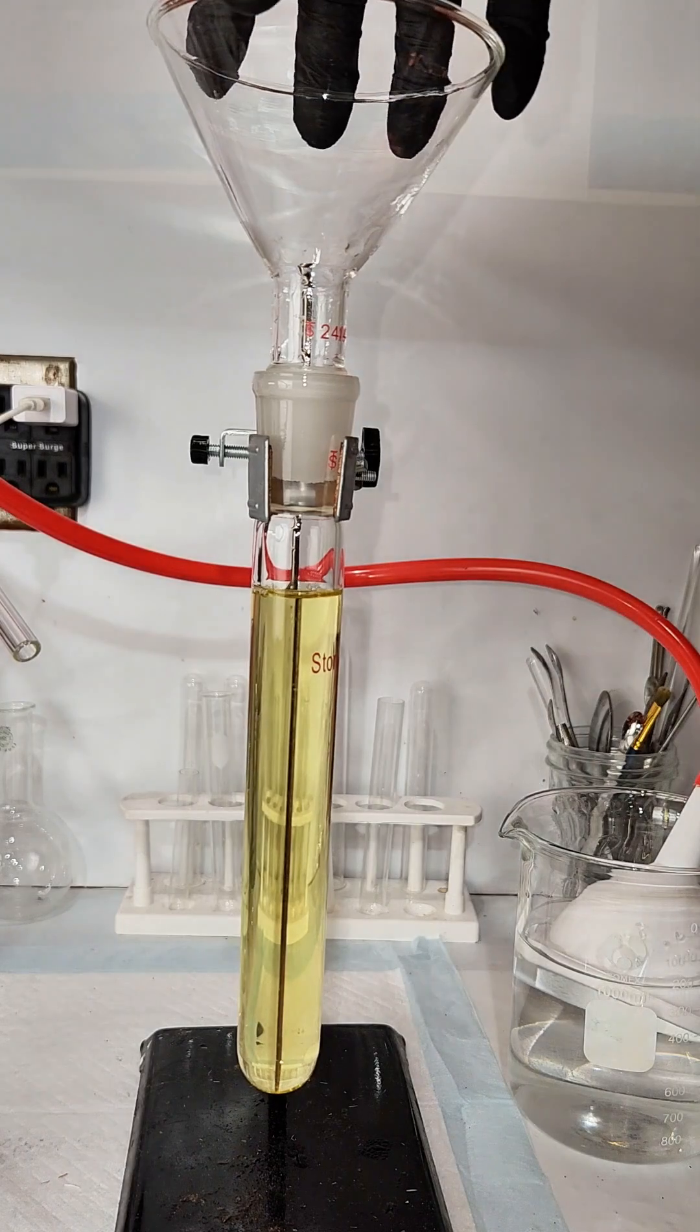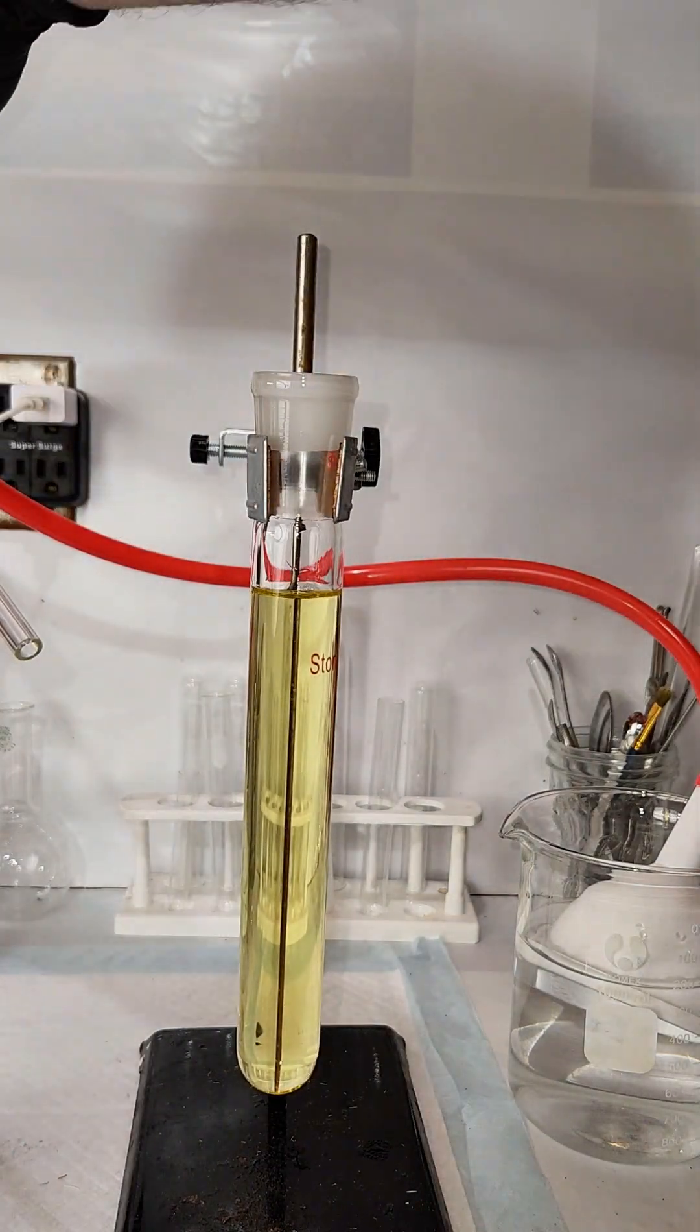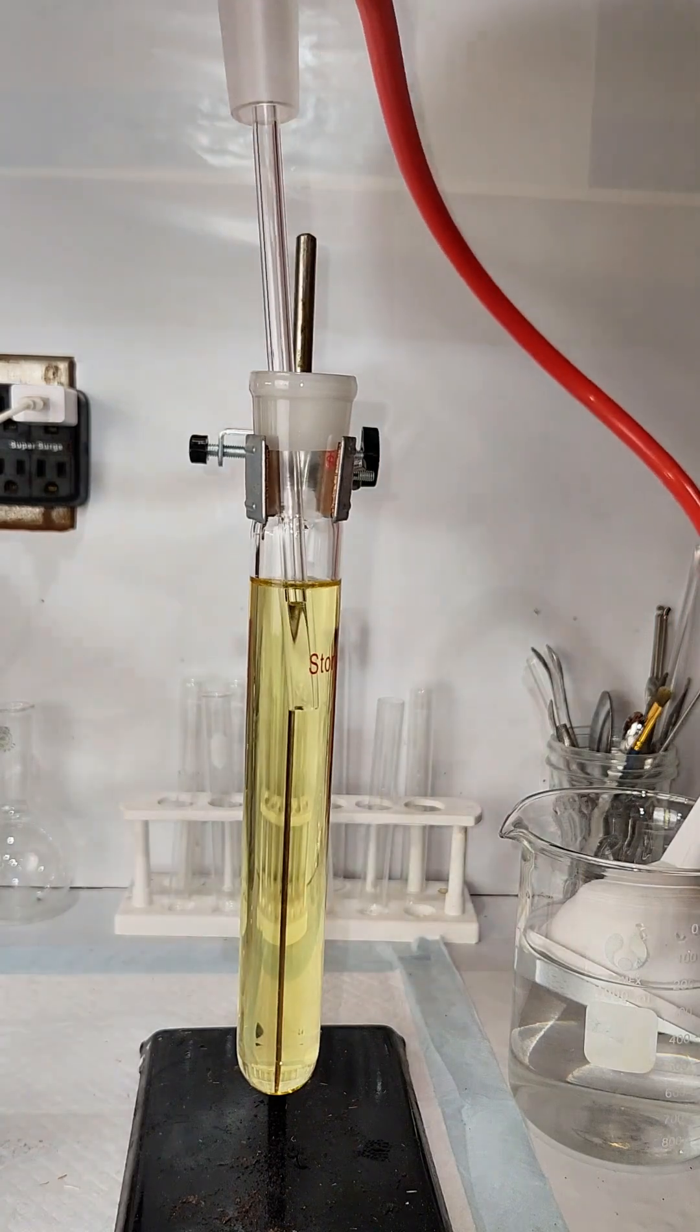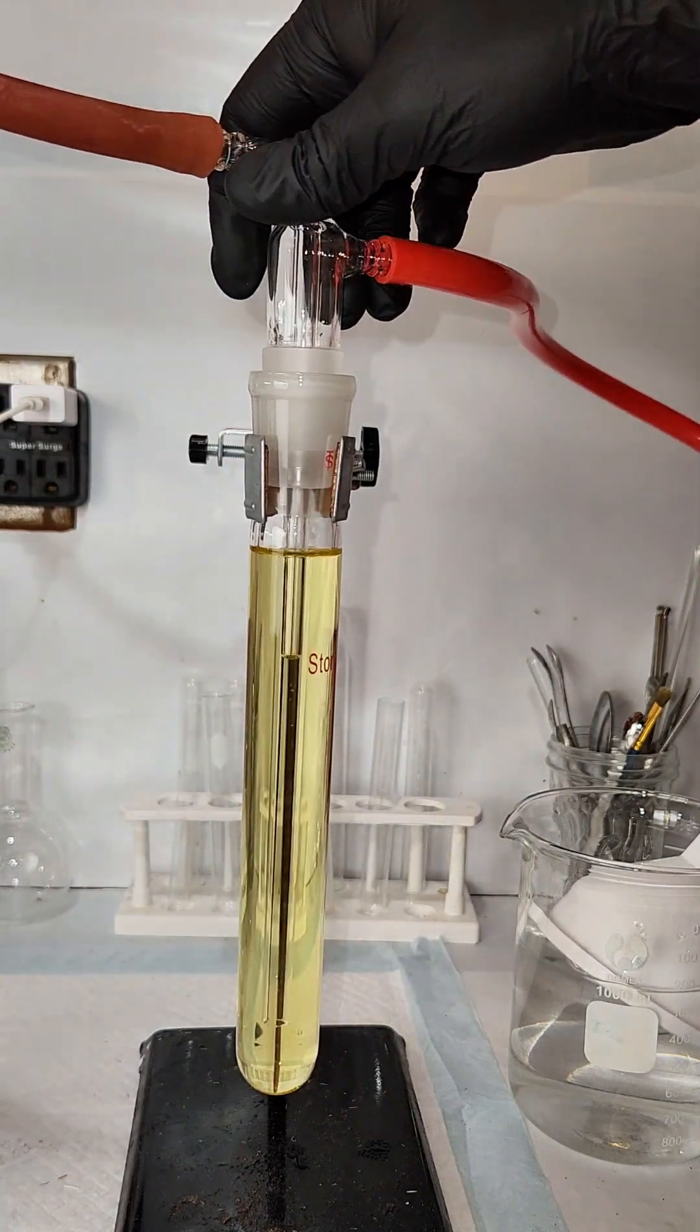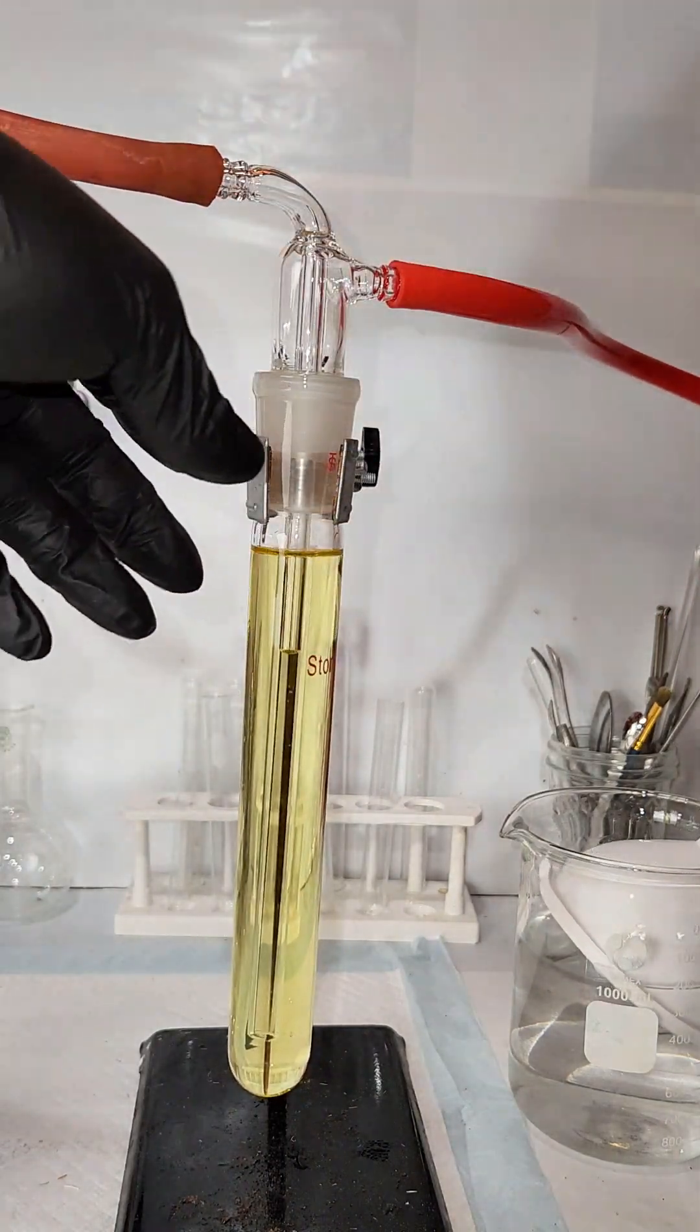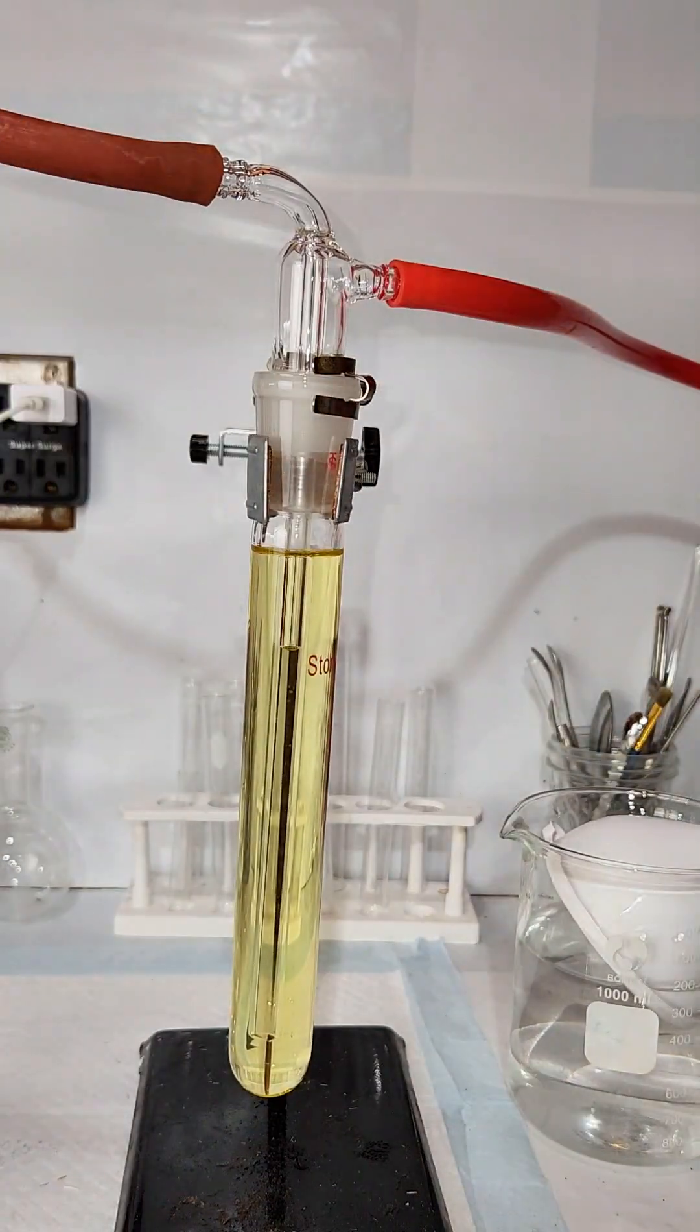to make ferricyanide from ferrocyanide, I begin by making a saturated solution of potassium ferrocyanide and add it to this cold trap. I typically use this piece to dry gases, and I'm only doing the reaction in it because it looks cool on video.